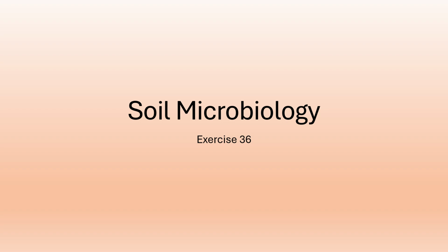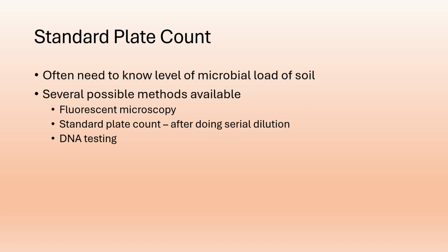In this exercise, we're looking at an example of soil microbiology. Sometimes, for various reasons, you may want to know what the level of microbial growth is in the soil sample. And so there's several different ways that you can do this.